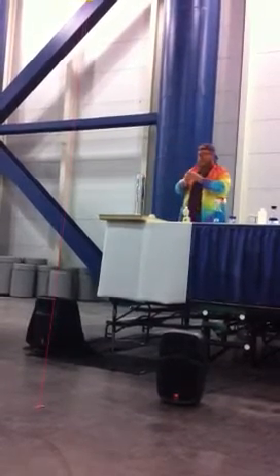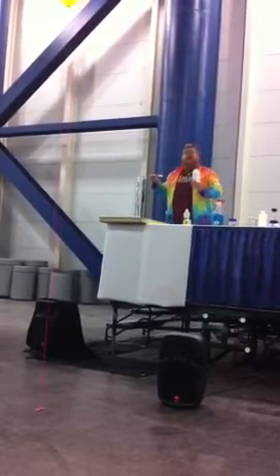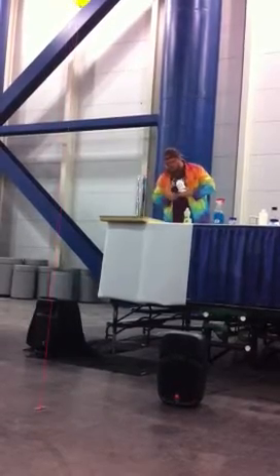Now the next thing I'm going to put in is some potassium iodide. Now you don't have potassium iodide per se in your body, but what you have is an enzyme called catalase. And when either potassium iodide or catalase runs into hydrogen peroxide, it does something kind of like this.